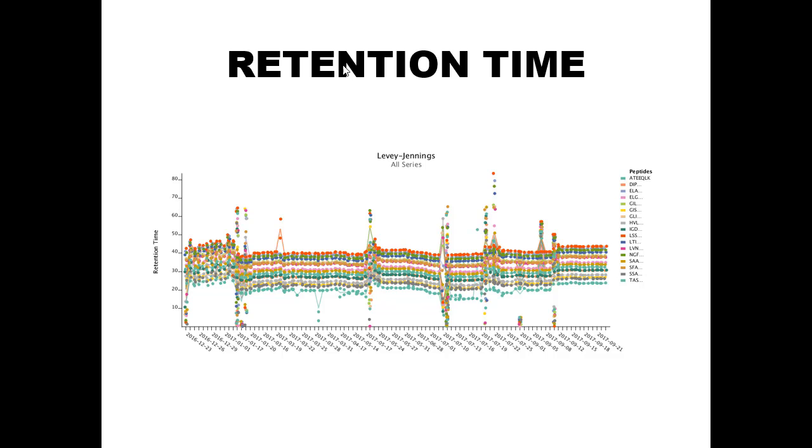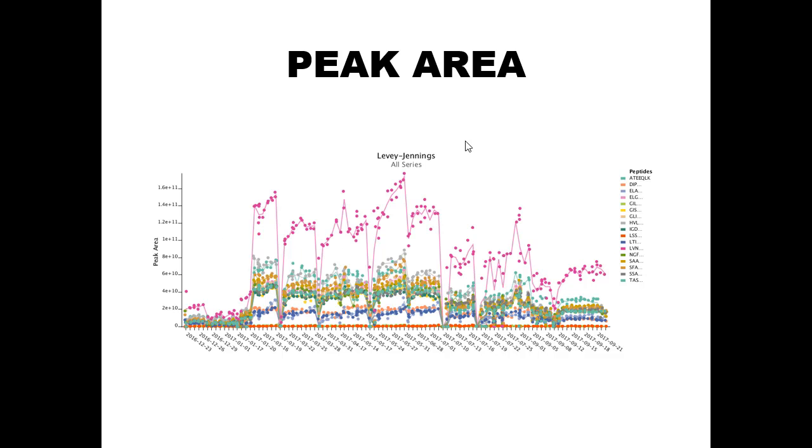Since this is retention time, this indicates to me that my liquid chromatography was not particularly good. This was pretty early into my data collection, so I was probably not very good at packing my own columns at the time. So maybe this is column packing variability, and then I got pretty good at packing columns, and the retention time stabilized.